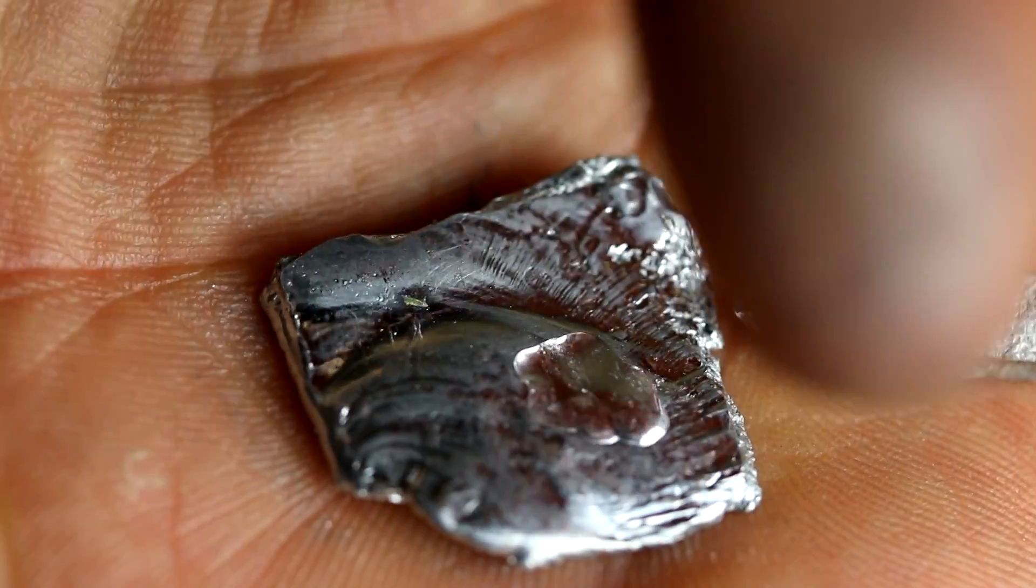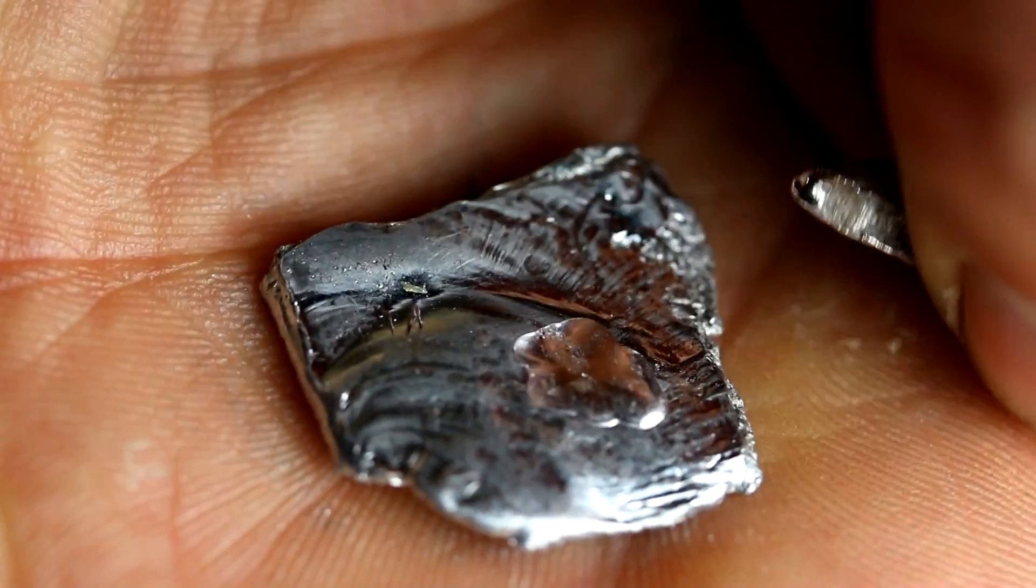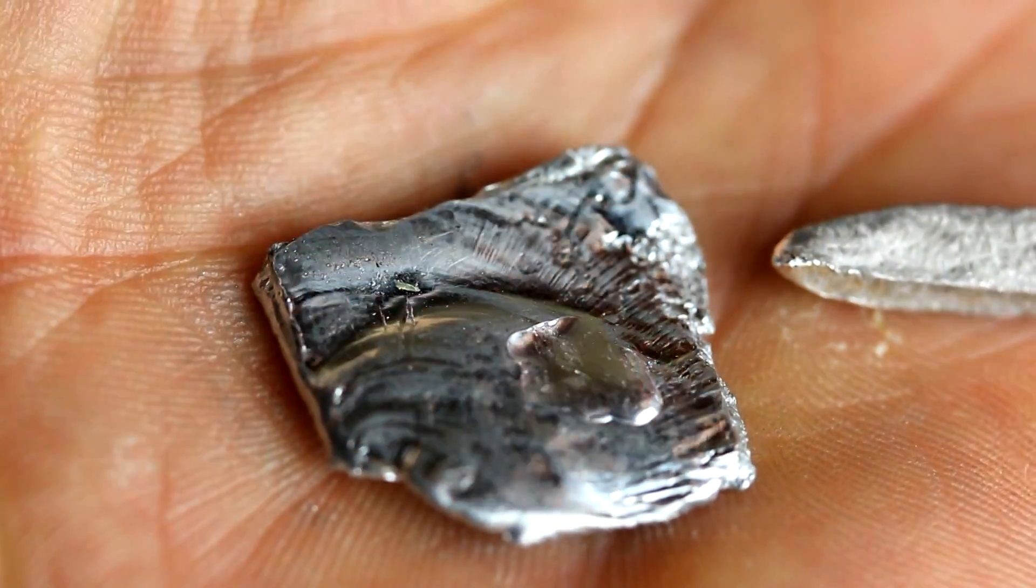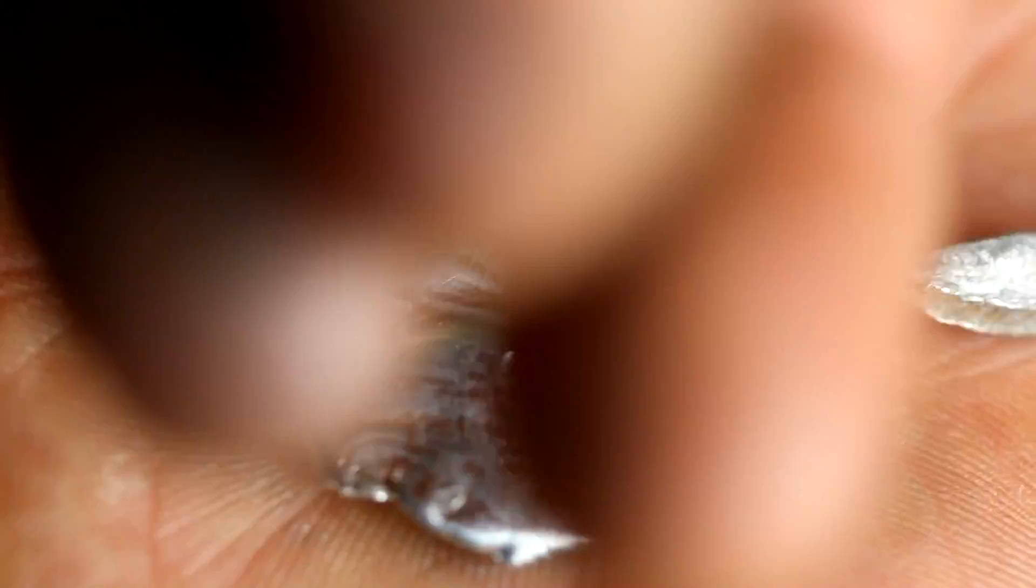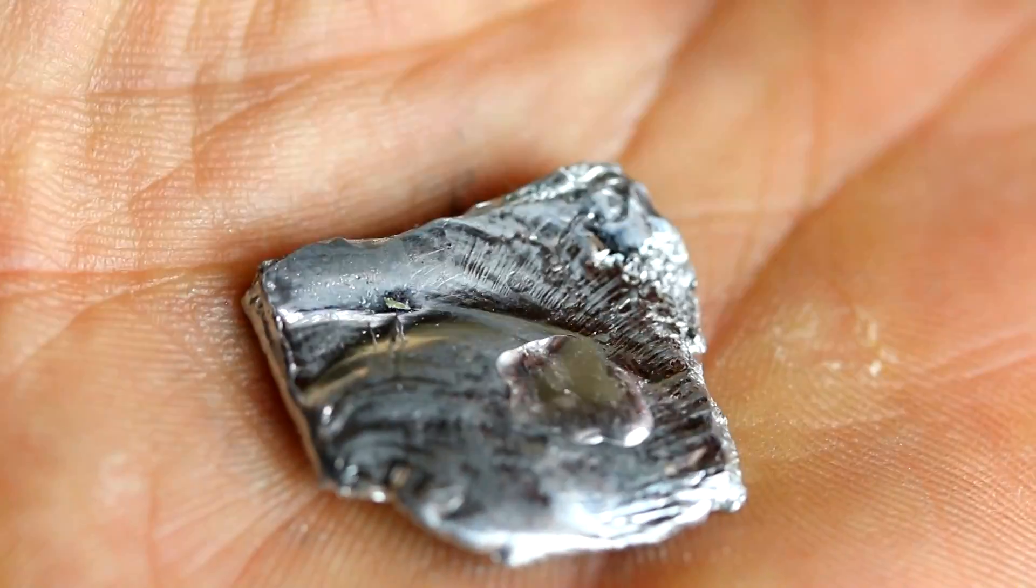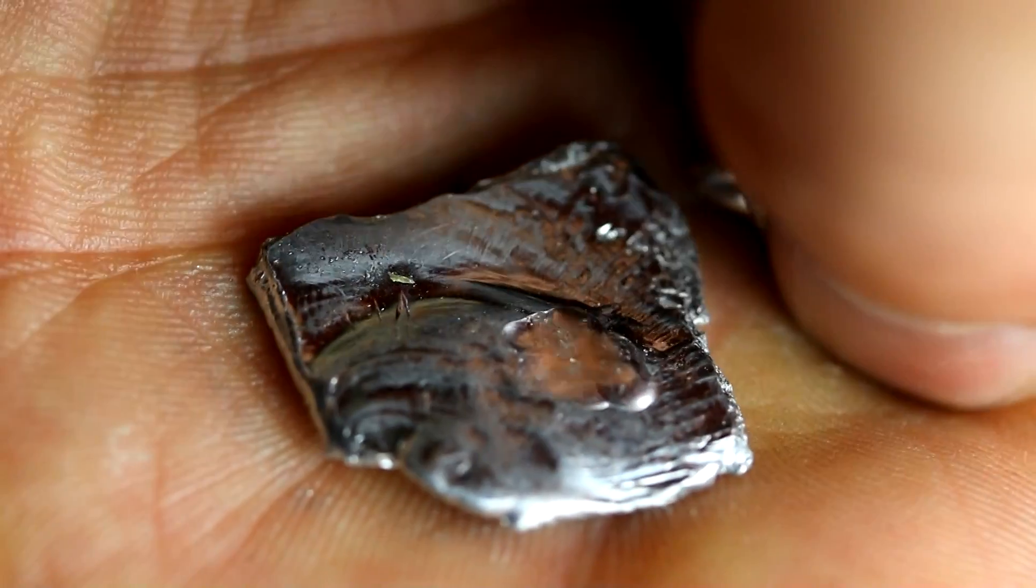Basically the second metal gets in the way of the crystal formation of the first metal and that causes the randomness to be a little bit more and so it's liquid down to a lower temperature.